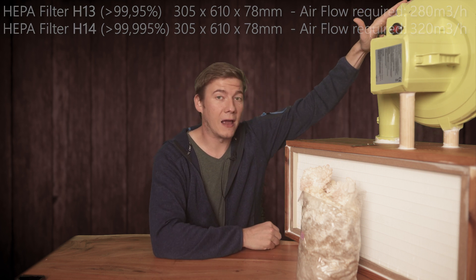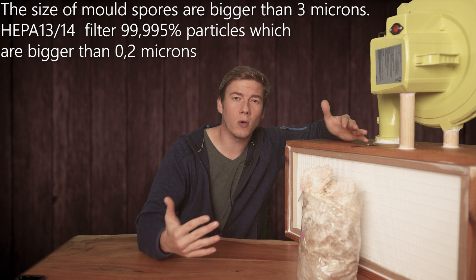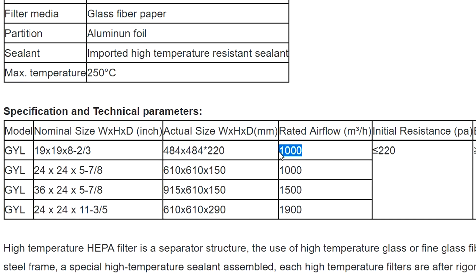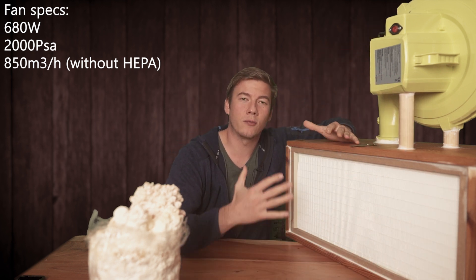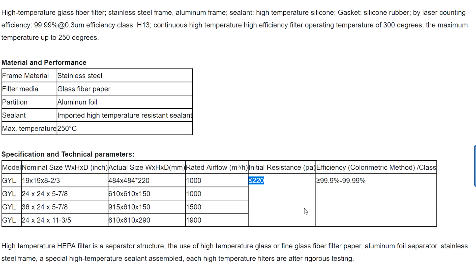Before we talk about the fan I used for the setup, we need to take a closer look at the individual parameters of those filters, because that is very important when you decide what kind of fan to buy for your individual system. Let's take for example this H13 HEPA filter. Most companies offer a couple of parameters — the size and the rated airflow. The bigger the filter, the more airflow is required. We need a fast airflow which blows away all the particles. So the bigger the filter, the more air is required to reach those flow speeds. The second parameter which is very important is the initial resistance.